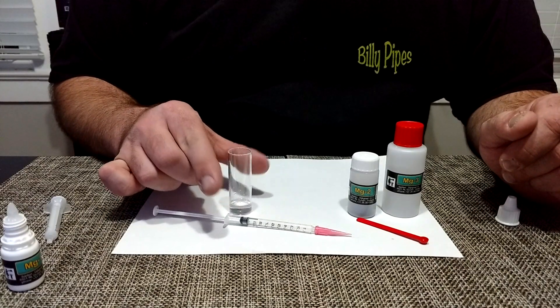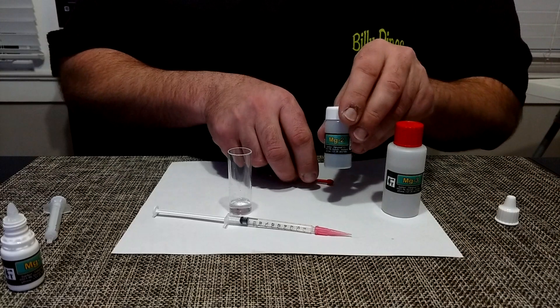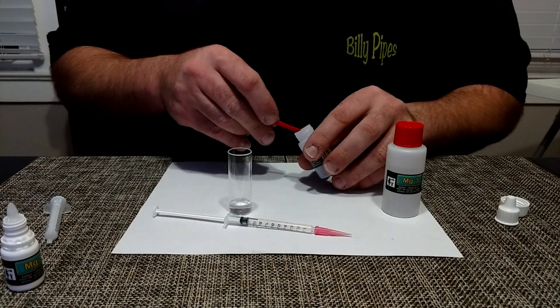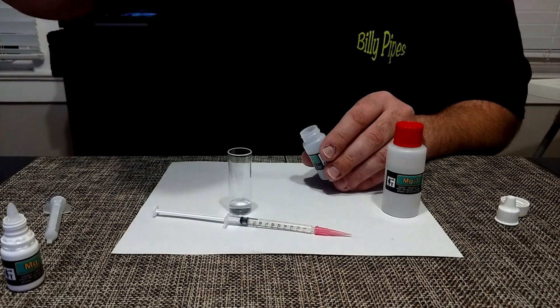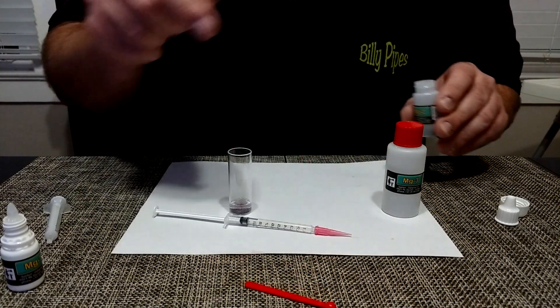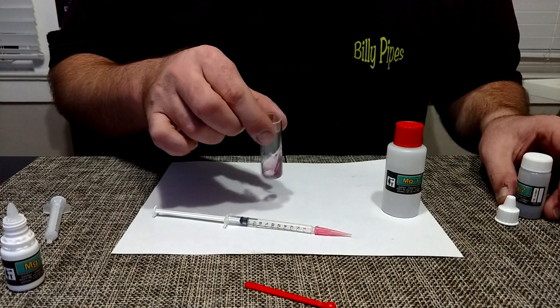That was 30 seconds. Next, you want to add one scoop of the MG2. Get it eye level, and you want to swirl this for 10 seconds.